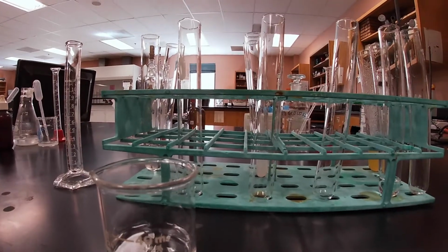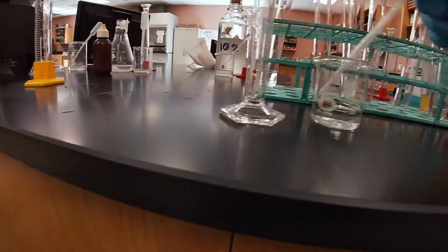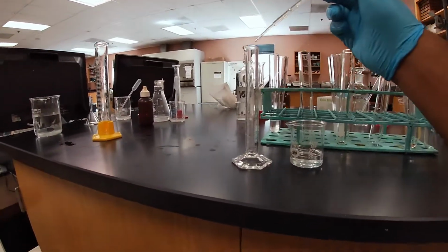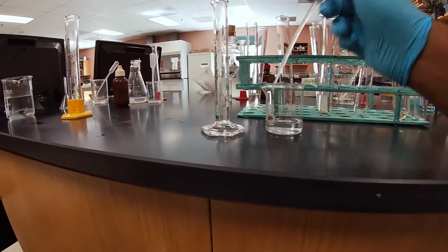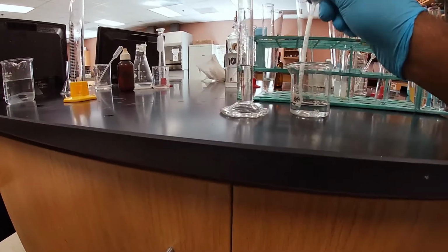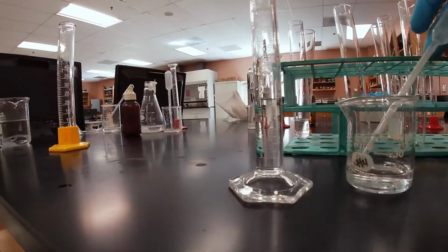So what we gotta do now is evenly add 5 milliliters of our outside contents after 30 minutes. We're gonna measure out 5 milliliters and distribute it into our test tubes. Okay, so those are about 5 milliliters.